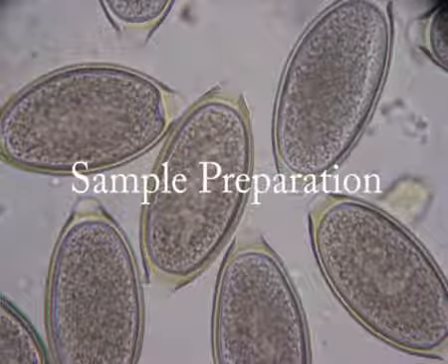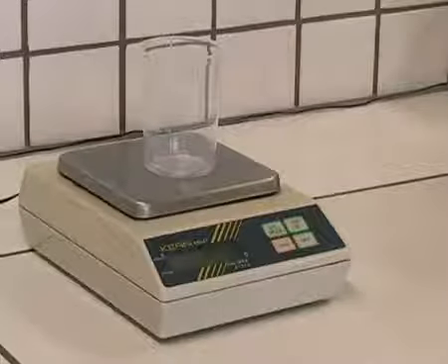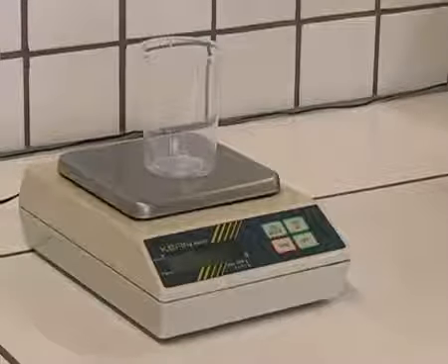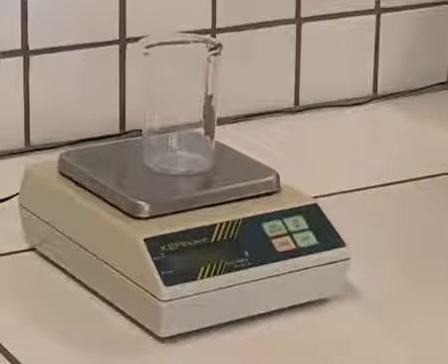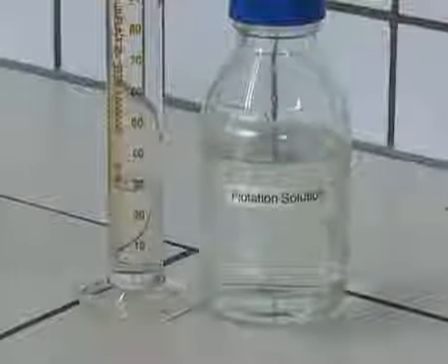Sample preparation. Place an empty beaker on the scale and press the tare key. Add 2 grams of the sample to the beaker. It is important to weigh exactly 2 grams as this may influence the accurate estimation of the fecal egg count. 30 milliliters of the flotation solution is added to the sample.